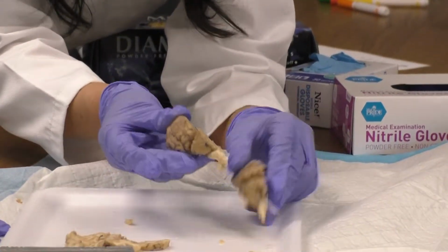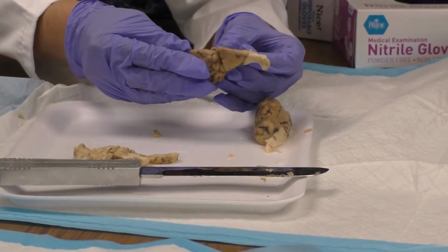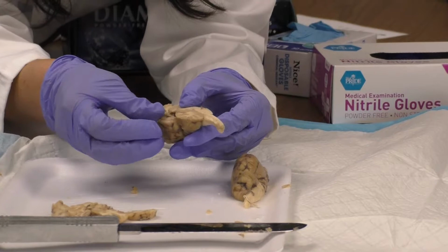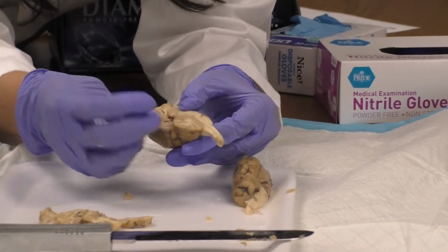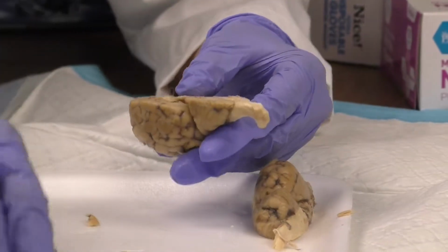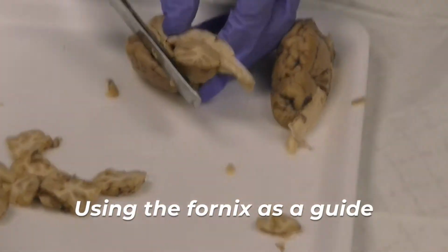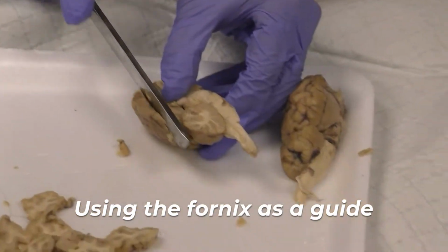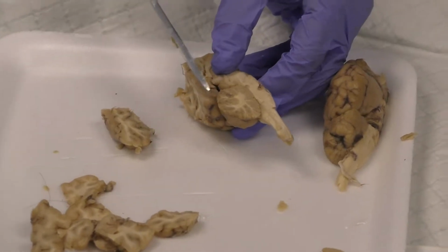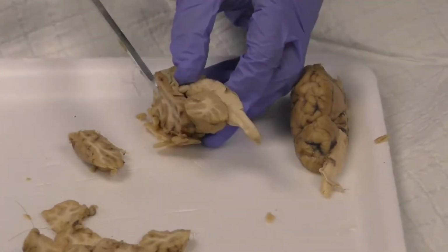So what I'm going to do is take one of the hemispheres, and so remember where that fornix was? There's the fornix. That means the hippocampus is right there. All the fornix is coming out of the hippocampus. You just can't see it as well. So I'm going to use this as a guide, and I'm going to cut down. Also, you can appreciate all the invagination.